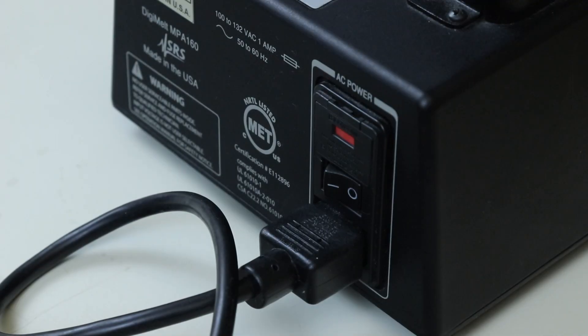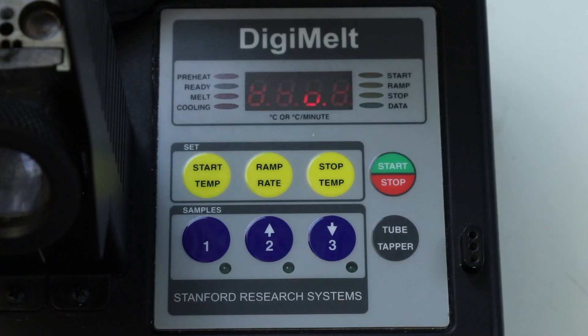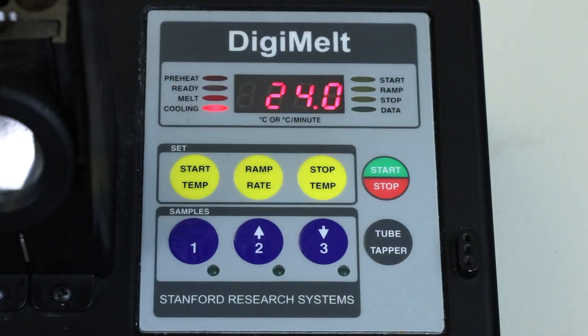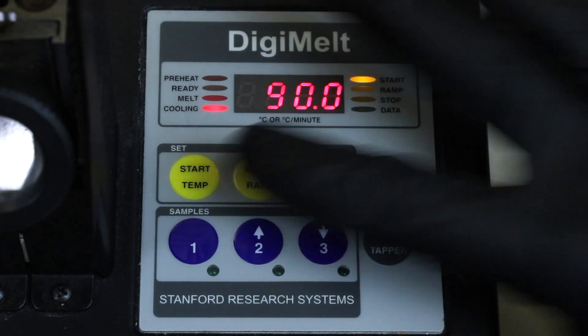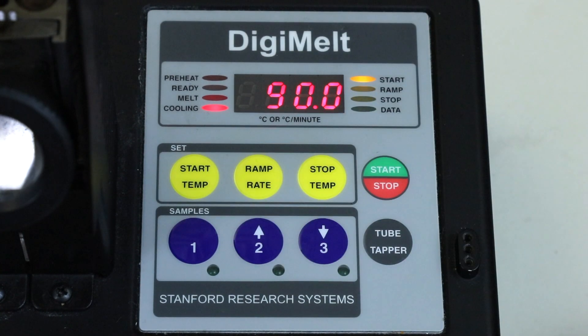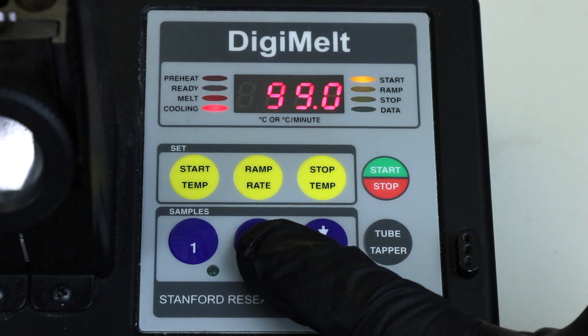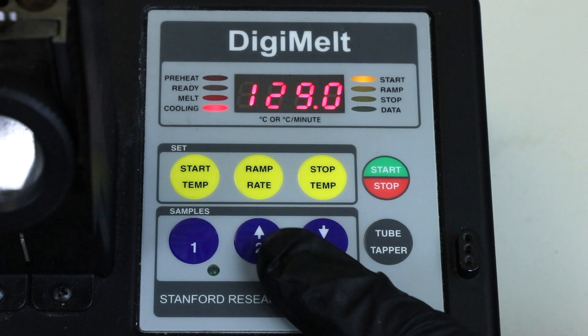On the back you'll find the power switch, and as you turn it on there are a few things to adjust to make sure it's set up correctly. The apparatus will initially be at room temperature, so you'll want to preheat it by setting the start temperature to about five or six degrees lower than the literature value for the melting point, just in case there are impurities in your final product. In this case the product melts at 134 degrees Celsius, so I'm going to set the machine to 129 degrees Celsius. You can adjust the temperatures by pressing and holding down the blue arrow buttons.